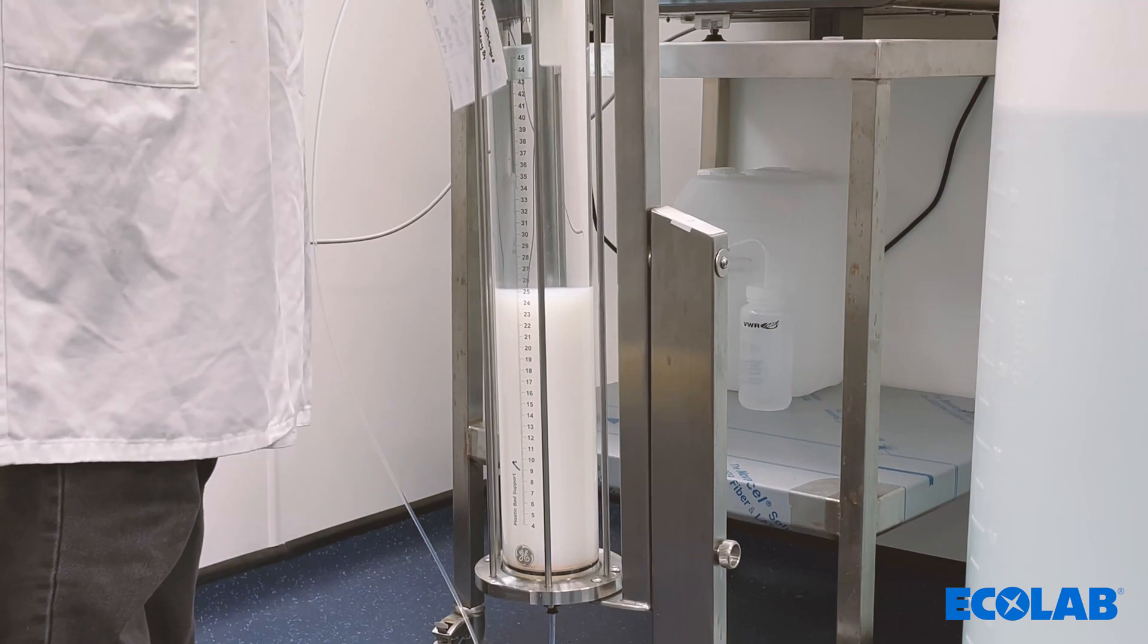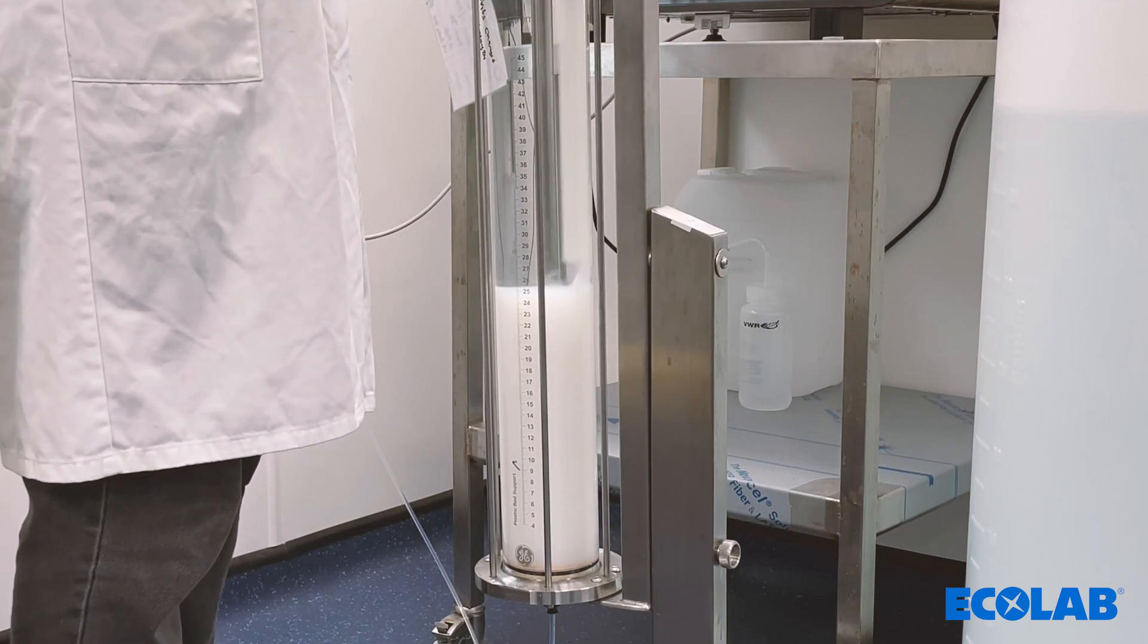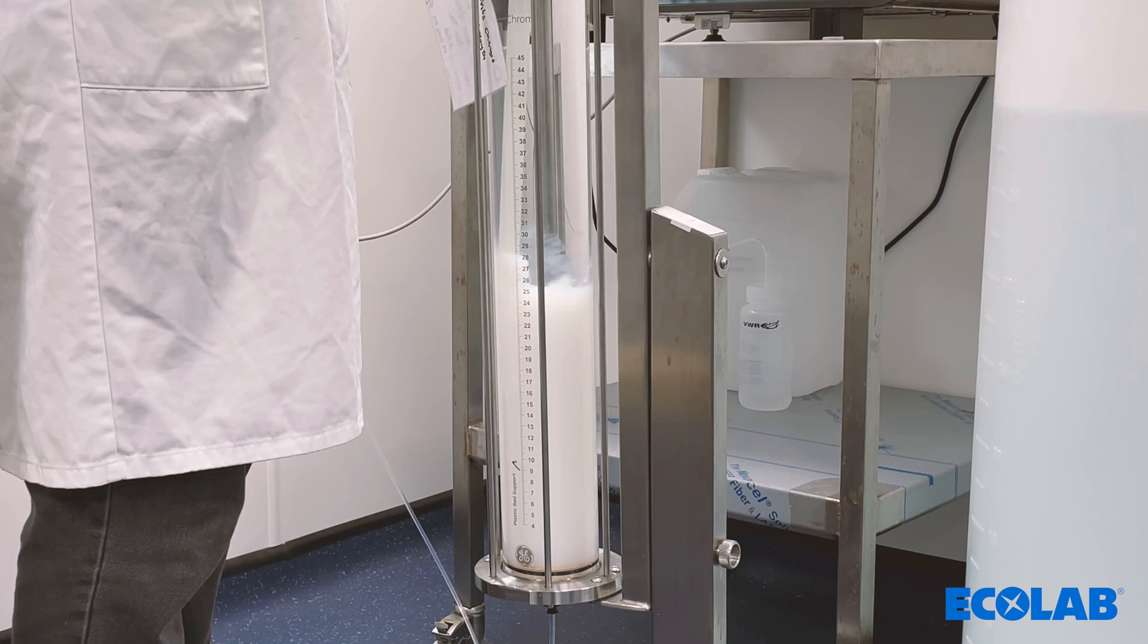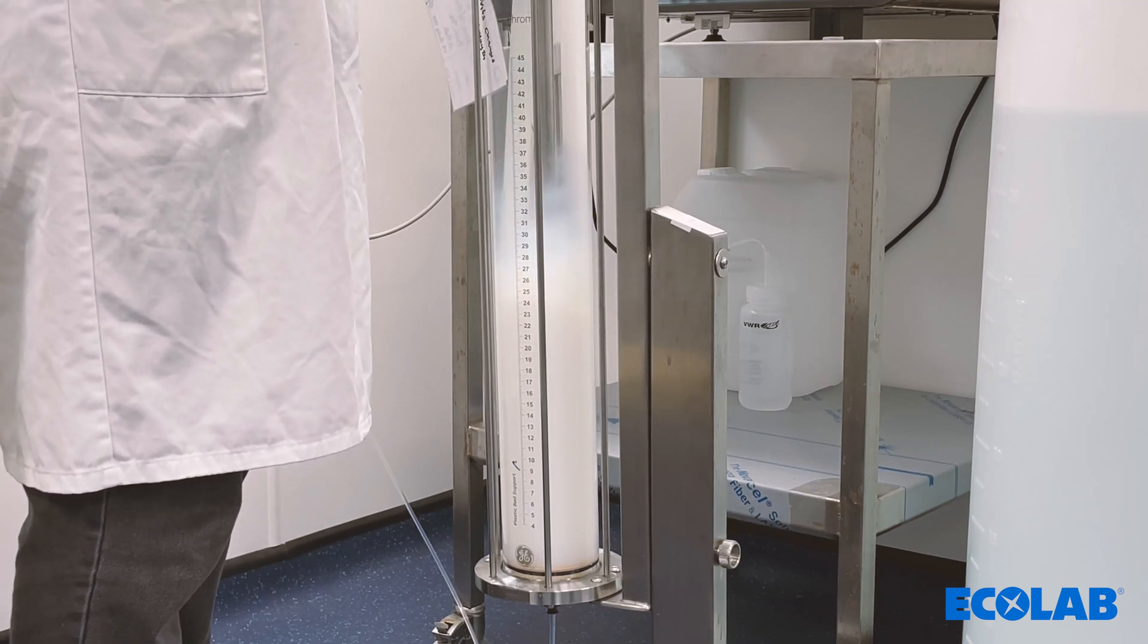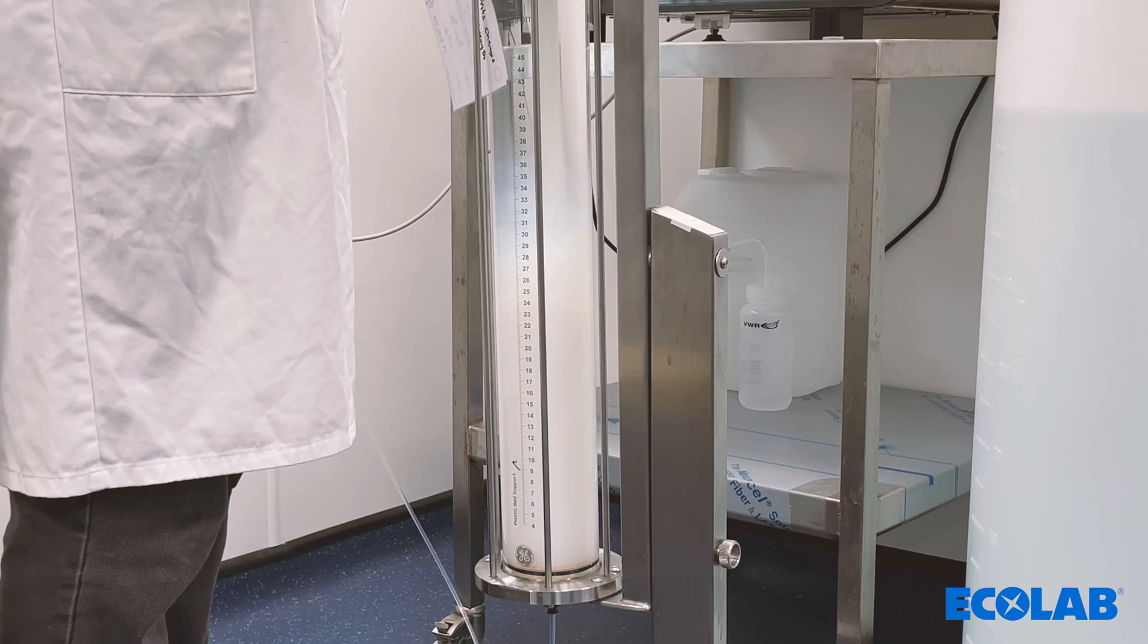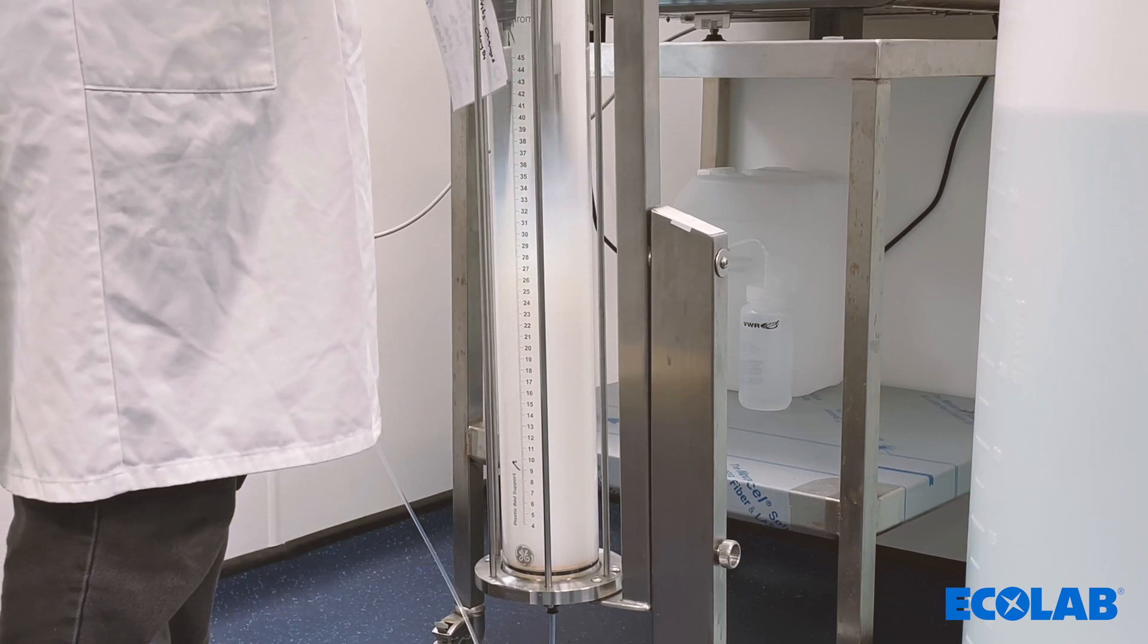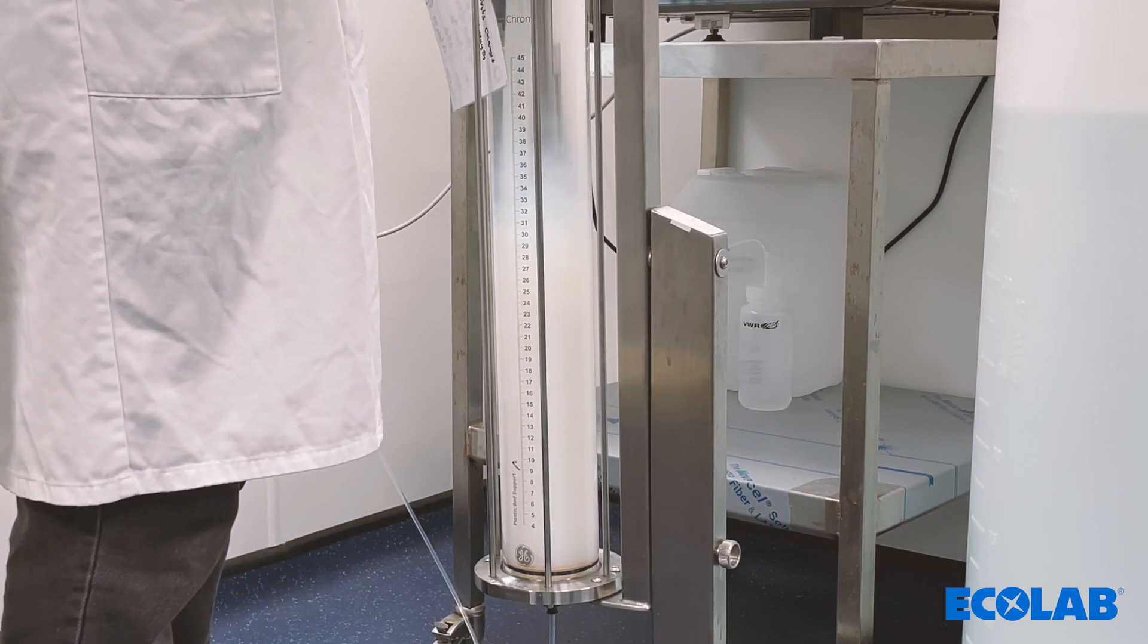Once the resin is in the packing buffer, the resin needs to be mixed to a homogenous slurry using the media wand. The resin needs to be allowed to settle up to 5 centimeters before the top adapter is added to the column. This avoids any resin being lost above the adapter.